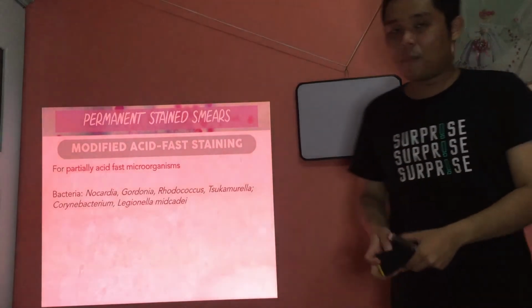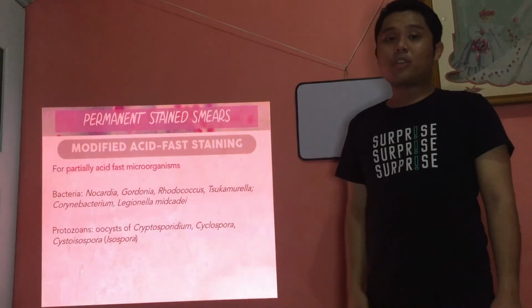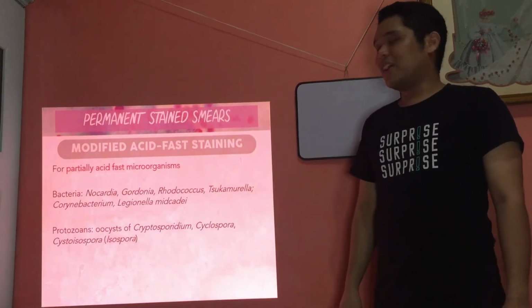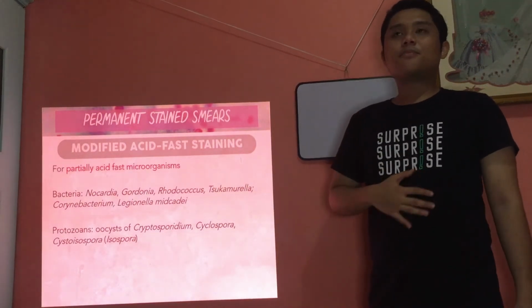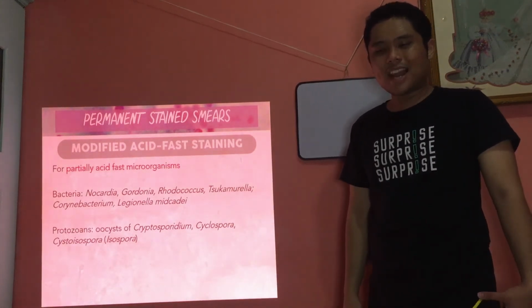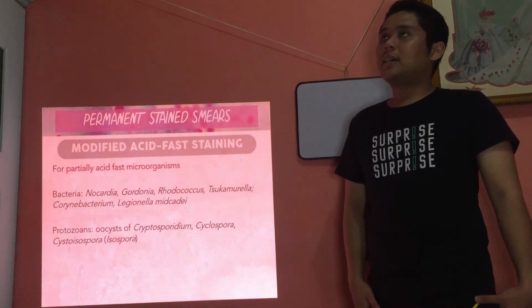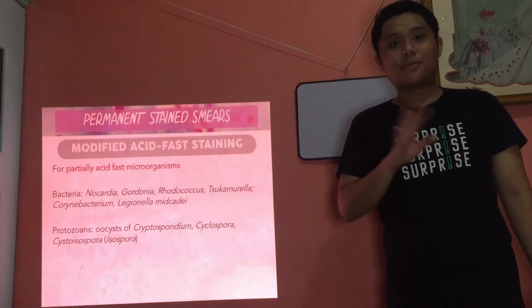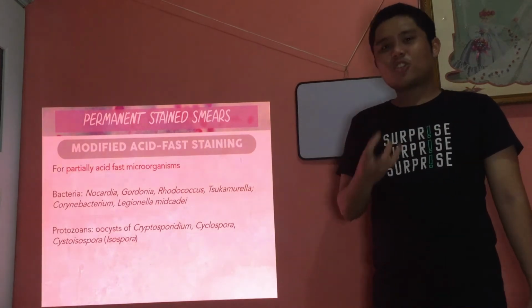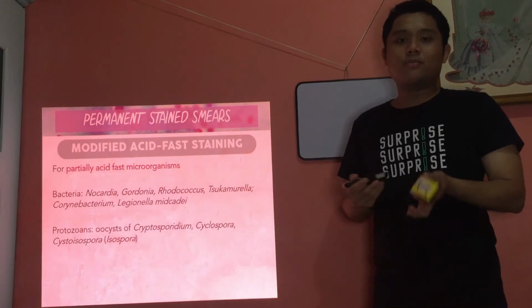Alright, okay. And for parasites, what we're really after are the coccidian oocysts: Cryptosporidium, Cyclospora, and Cystoisospora. I've discussed Cryptosporidium in the life cycle. It's quite the same for all three: usually ingestion of food or water.